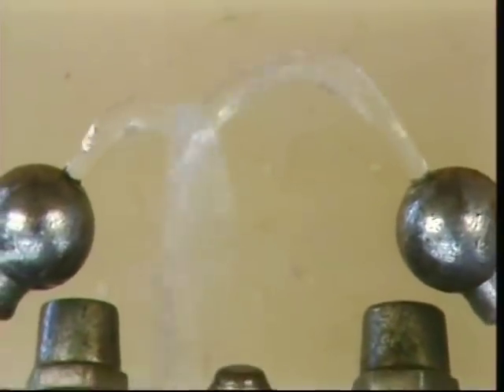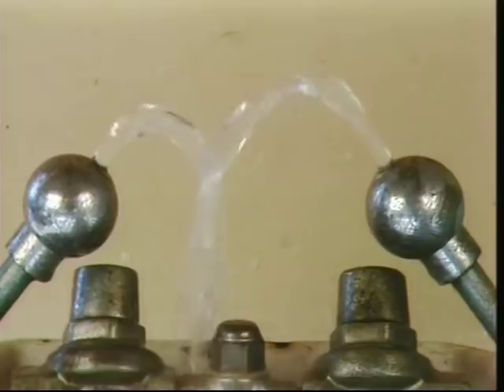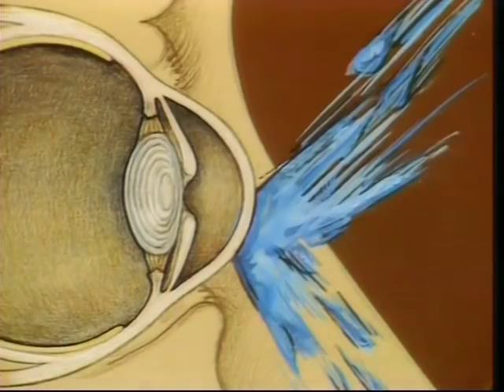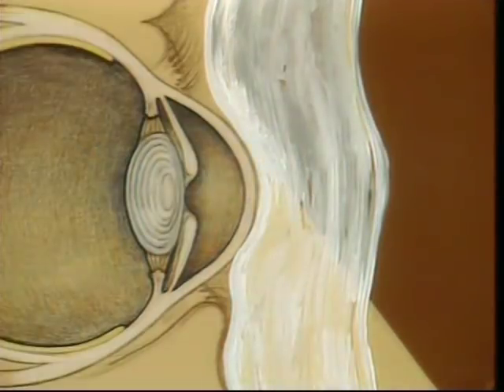Now, this is particularly important if you get something in your eye. Immediately go to the eye wash and irrigate the eye for 15 minutes. The eye works like a sponge, and when a chemical comes in contact with it, the chemical can be absorbed deep into the eye, just like the skin. Washing the eye cleans the surface of the eye first. It's only after prolonged washing for at least 15 minutes that the water succeeds in flushing the chemical out of the internal structure of the eye.